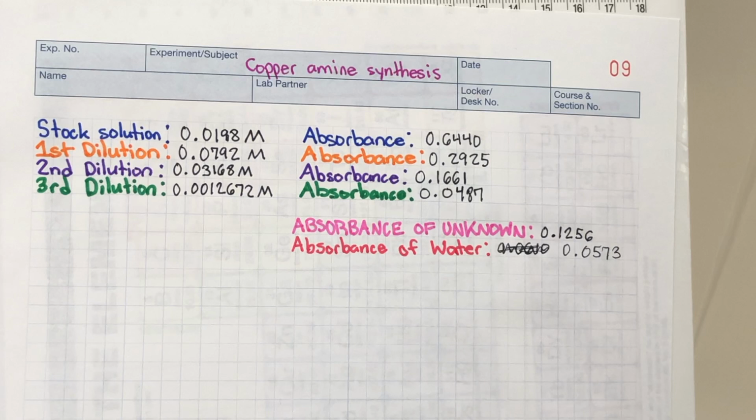The Beer-Lambert law relates the attenuation of light to the properties of the material through which light is traveling. This law states that the quantity of light absorbed by a substance dissolved in a fluid transmitting solvent is directly proportional to the concentration of the substance. Now for our calculations.